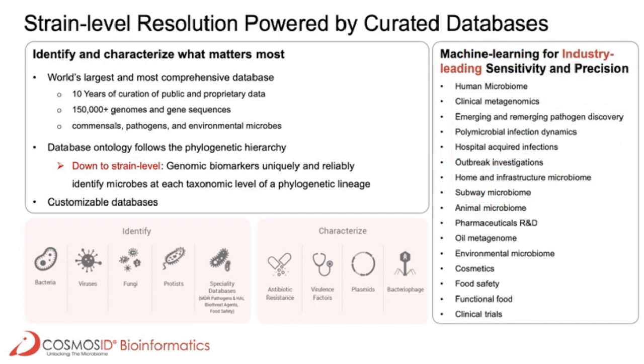Subsequently, we employed machine learning techniques to develop filter thresholds by analyzing thousands of in silico, laboratory-generated and orthogonally validated datasets comprising varying levels of microbial diversity and complexity, and helped achieve significantly increased detection specificity.